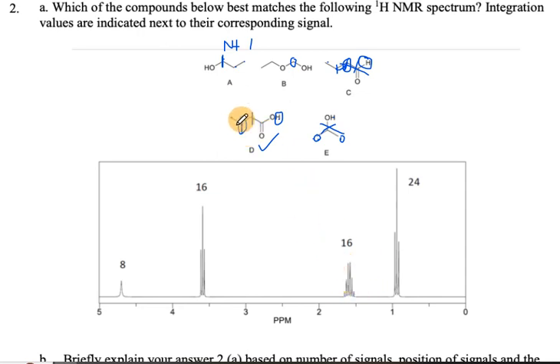Then the terminal one is, of course, we have 3 at the end. So we have 1 plus 2 triplet. So in this compound, we have 2 triplets, 1 singlet, and 1 sextet. So meaning this compound is the right candidate for this spectrum.